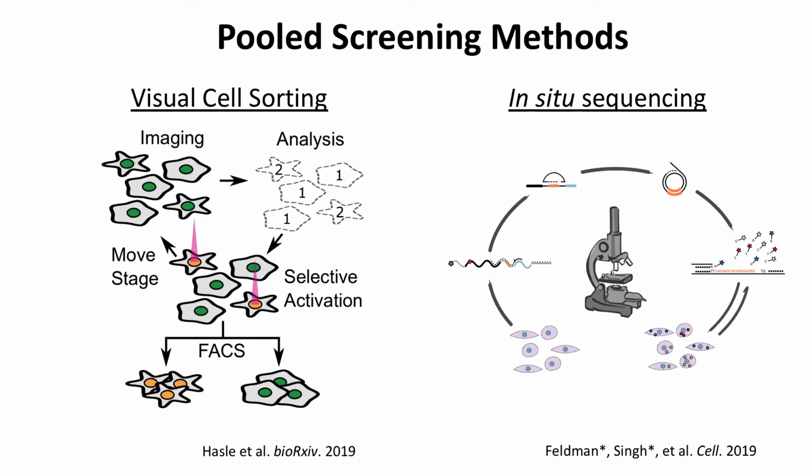Yeah, so we can get through about 1 million cells in 12 to 24 hours, depending on how fast your image analysis pipeline is. So that's the scale we're working with.